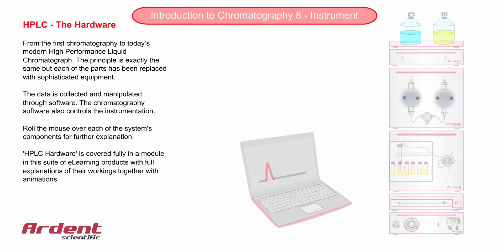As you roll the mouse over the instrument, you will be able to get an overview of a high-performance liquid chromatograph. The detailed workings of the HPLC hardware shown here are fully covered in the HPLC hardware e-learning module.